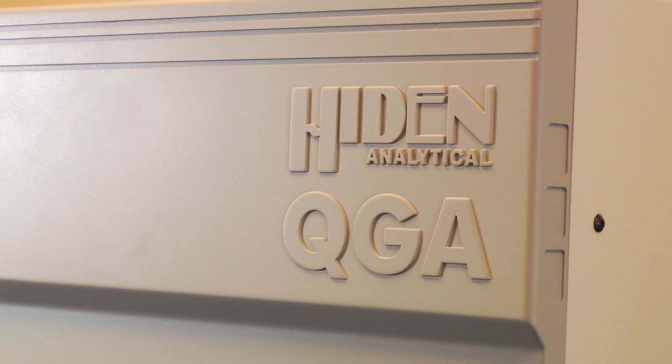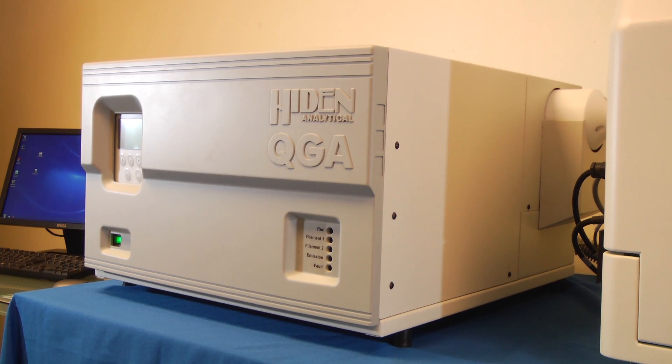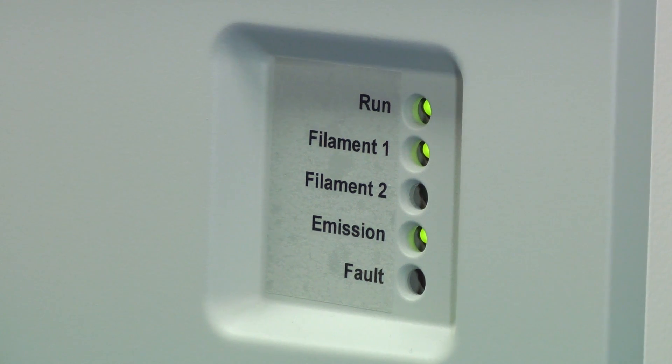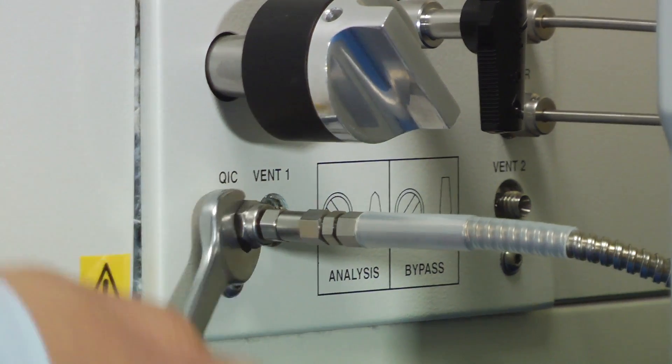For monitoring reaction products from the CATLAB, the system uses the Hiden QGA gas analyzer. Additionally, the QGA can be disconnected from the CATLAB and used as a stand-alone gas analysis system.